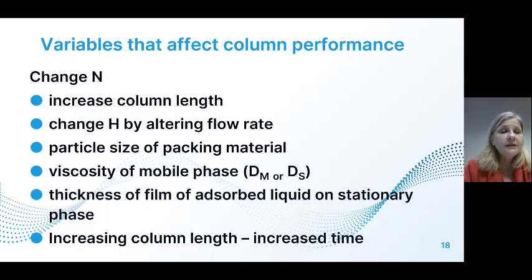So if we want to change our number of theoretical plates, if we change the column, we can also choose a longer length, because immediately if you have a longer length, then you would also have a better separation. Just keep in mind, if your column length becomes longer, you are increasing the time of your separation. And if you have lots and lots of samples, you can't have a run taking 60 minutes for the separation.